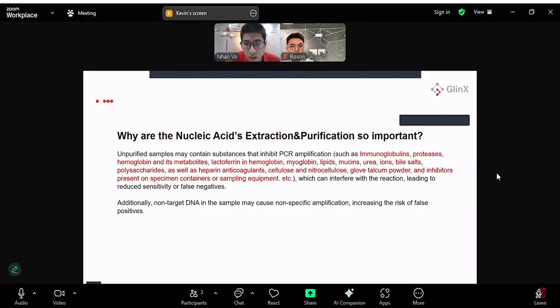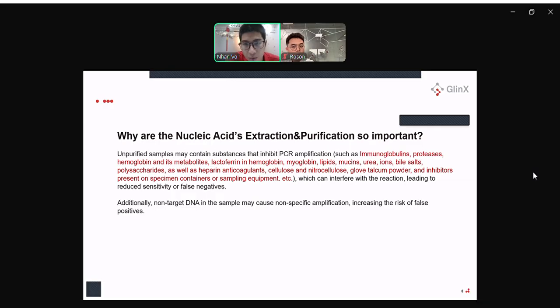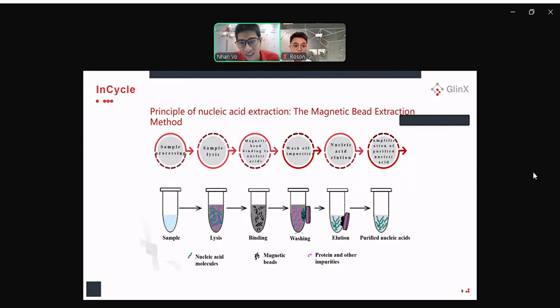Yeah, okay, let's move on. I would like to know what kind of extraction method the Incycle machine you are using right now uses. Yeah, the magnetic beads method. Okay, okay.